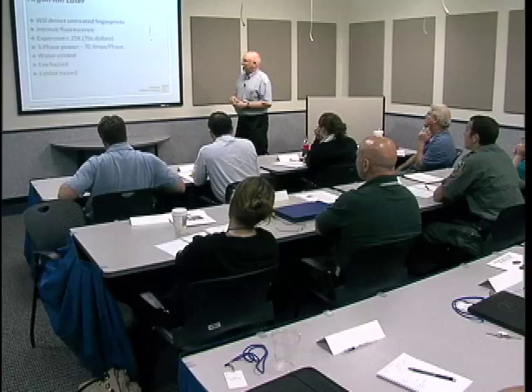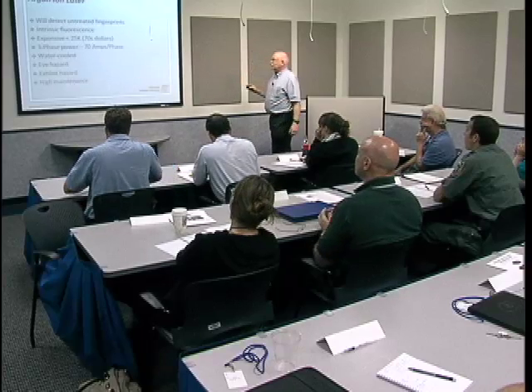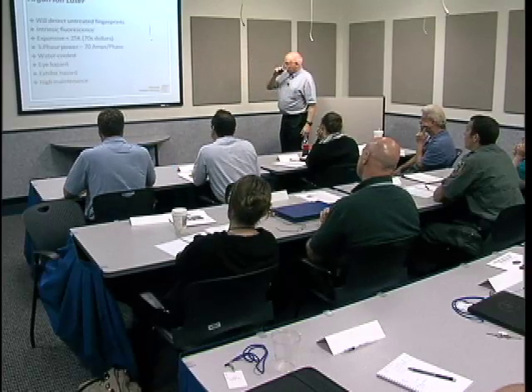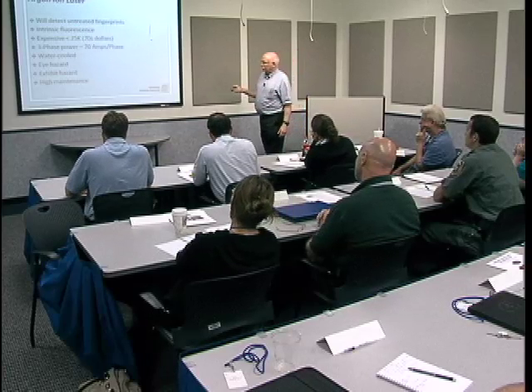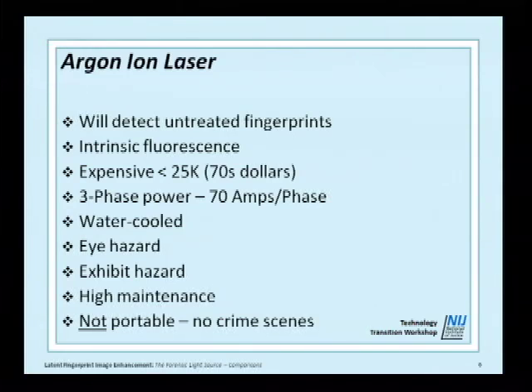So it has a very, very serious exhibit hazard. And as I mentioned before, high maintenance. It's like owning a British sports car. You've got to be a mechanic to really effectively own one. Not really portable, in spite of what we did with the mobile crime unit. It's transportable, but that's a different concept from portable.